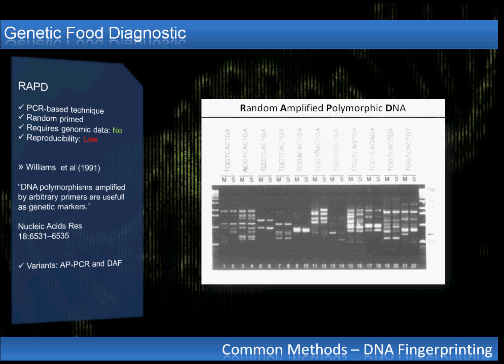In my experience, even the concentration of the template changes the pattern, so it's not very stable fingerprinting.